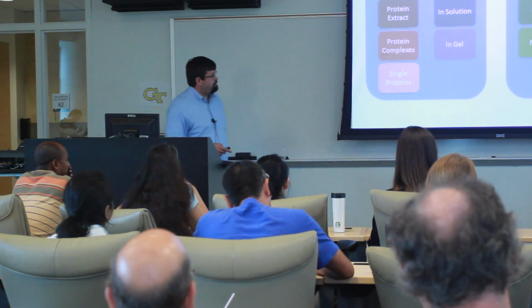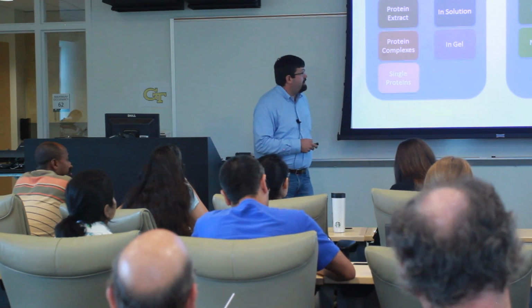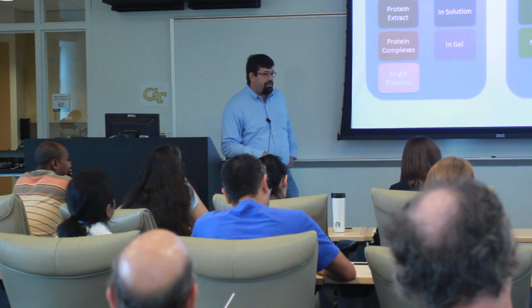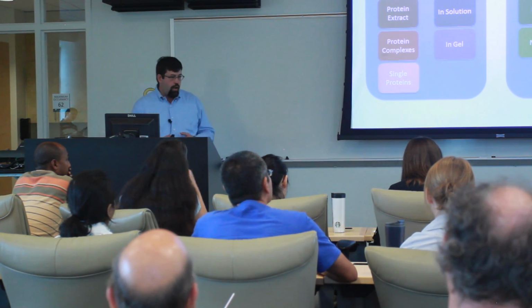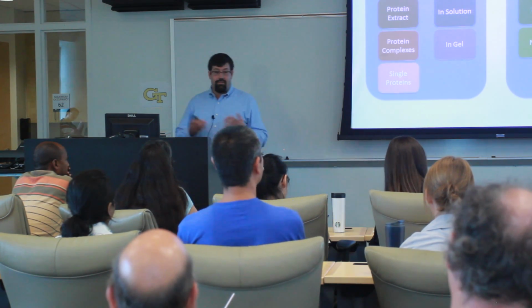mass spec experiment. And on the mass spec side, you could either do an LC separation. I have here reverse phase liquid chromatography, which could be coupled to the Orbitrap. You might not separate at all and just do MALDI TOF. The beauty of separating is that you overcome a common problem with proteomics analyses, which is ion suppression.